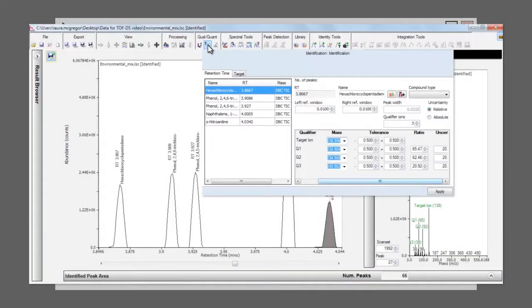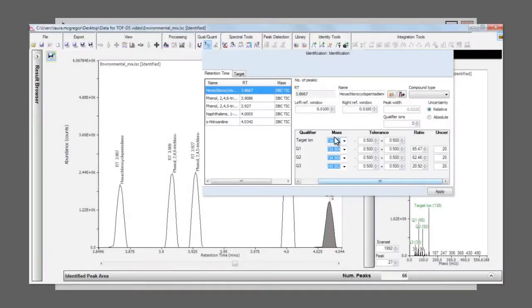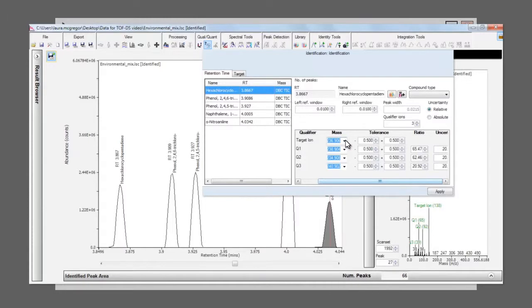In addition, quantifier ions and qualifier ions are automatically added, but you can choose to override this default decision and select your preferred ions if necessary. Selecting new ions will update any of the ratios that have already been calculated.